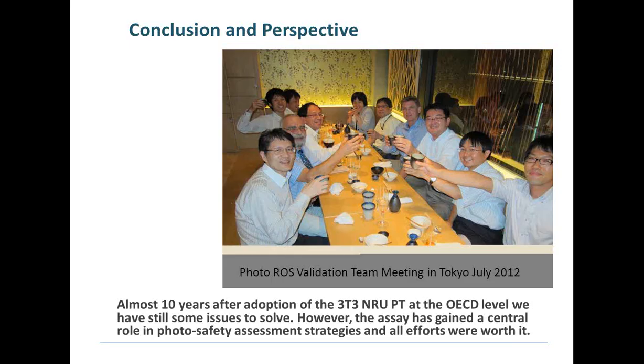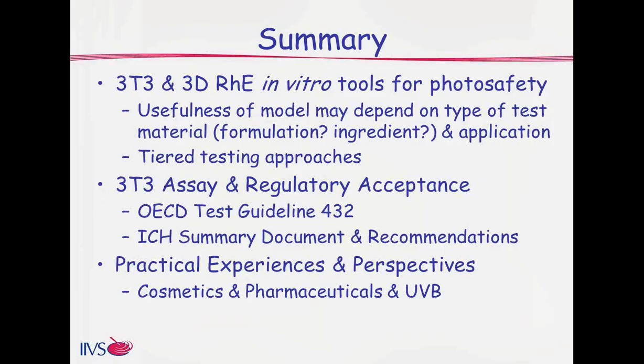And so what I wanted to say is almost 10 years after adoption of the 3T3 assay at the OECD level, we still have issues to solve. However, the assay has gained a central role in the photo safety assessment strategies, and therefore all efforts are worth it. Thank you very much.